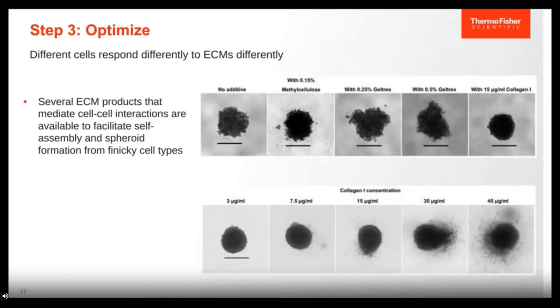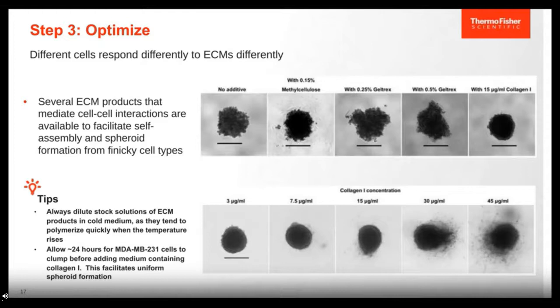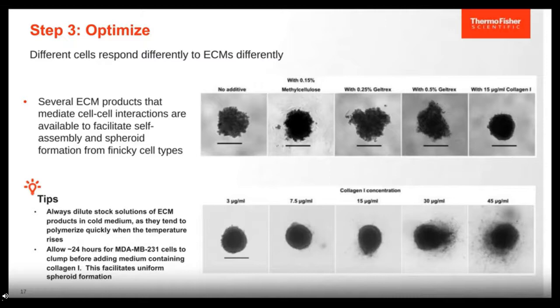As you can see, going with higher amounts of ECM reaches a point where too much is detrimental to forming a nice spheroid. A couple of tips when doing this optimization: many ECMs are temperature dependent and will polymerize when approaching 37 degrees, so make sure the medium you're using is pre-chilled. For the 231 cells specifically, when you seed the cells, it's recommended to let the cells sit in the well for 24 hours to let them clump, and then add your medium containing your ECM. This technique helps facilitate uniform spheroid formation for this particular cell line.